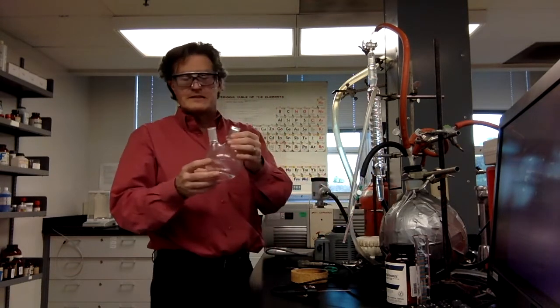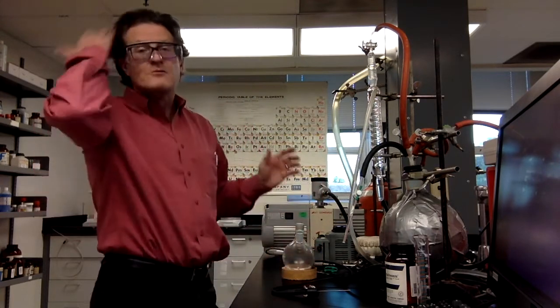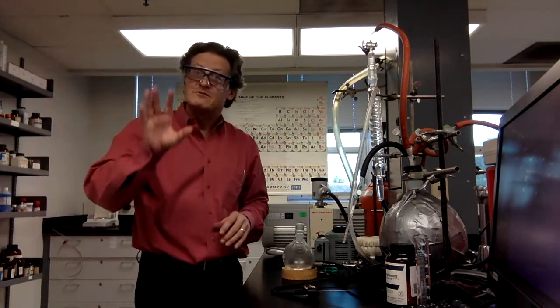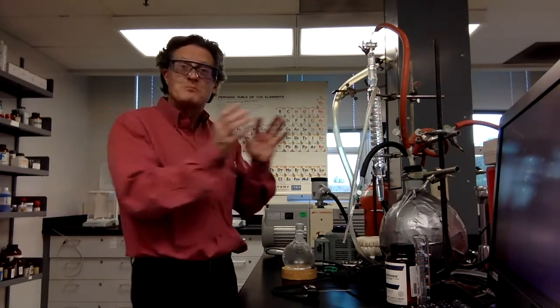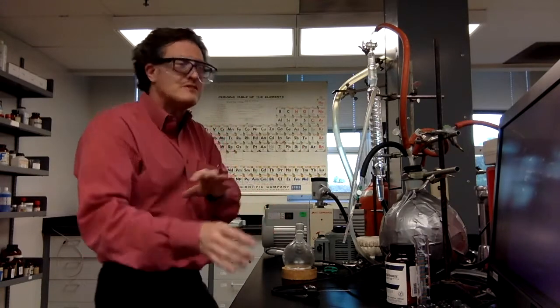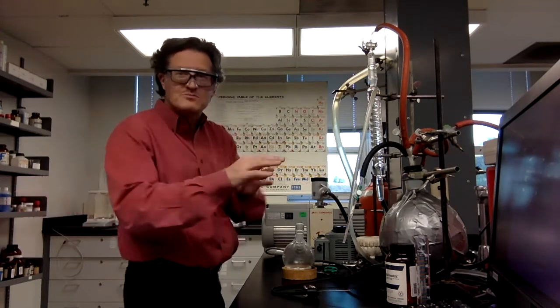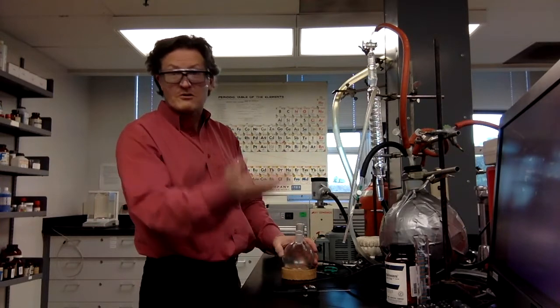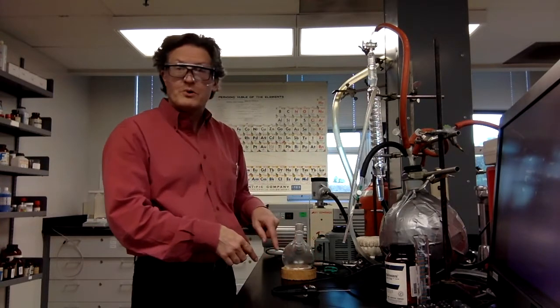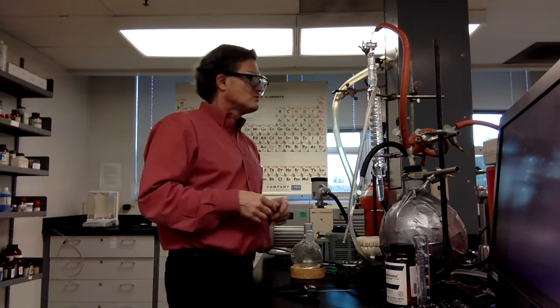And then we've got the ethanol. We will dispose of that appropriately. The ethanol can actually go down the sink, and heptane, of course, can't. That will have to go into a proper waste container, and heptane goes in with non-chlorinated solvents. You keep your polar solvents away from your non-polar solvents. So all of our organics go into one waste bin, and our aqueous waste goes in a separate waste bin. Since there's nothing else in the alcohol, it can go down the sink. But we don't want to throw the boiling chips down the sink, so let's just be careful. And that way we've got this all taken apart.